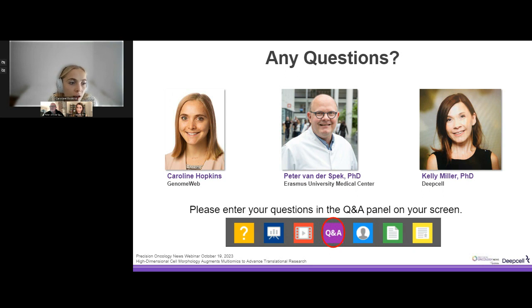A couple of questions on the timing and the workflow. One, how much time is needed to generate the UMAP? And actually, this is sort of a two-part question, but related: will the UMAP update correspondingly during the cell sorting?